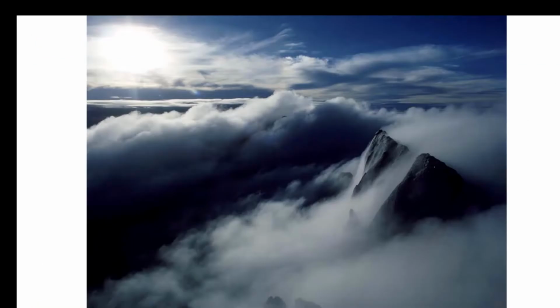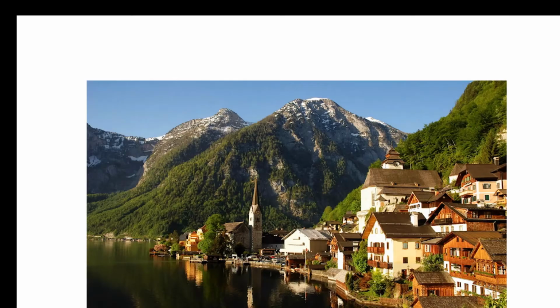So, we started with a picture like this at the beginning of the presentation, noting how the clouds masked our view of the mountain. I said that these clouds were like the cellular fog or out-of-focus blur that hinders our view of the cell when using epifluorescence microscopy. TIRF avoids the generation of this fog, lifting the clouds away and allowing us to see the fine details that lie at the bottom of the mountain.